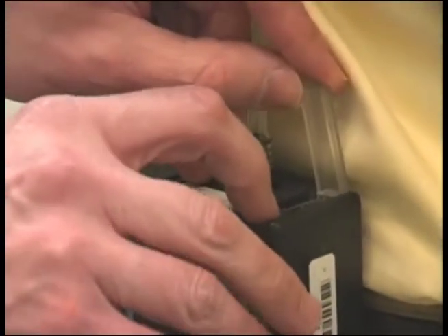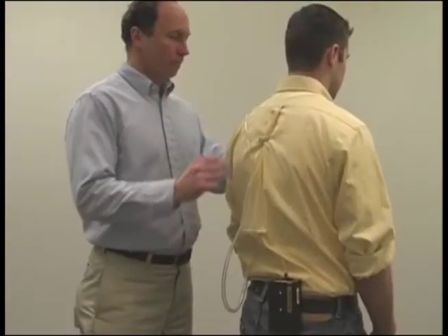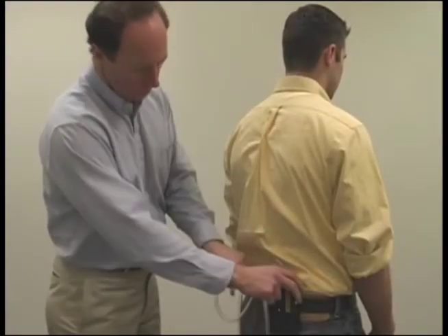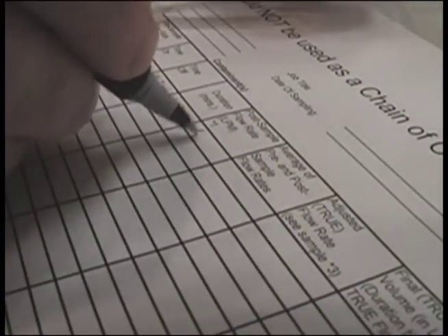After sampling is complete, turn off the pump, record the time, remove the equipment, and perform a post calibration, preferably in an area with the same approximate temperature as was used during the pre-calibration. Then record the flow rate on the pump calibration sheet.